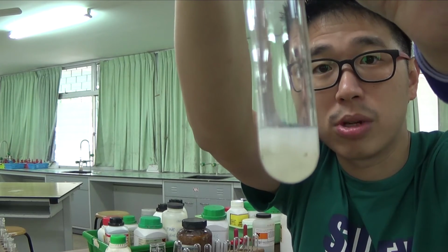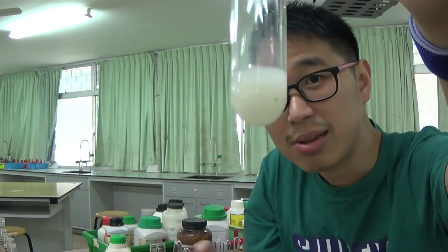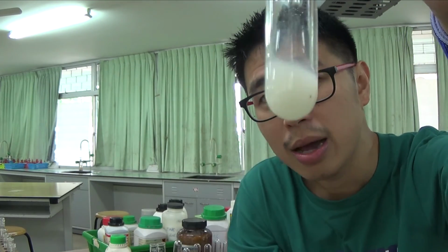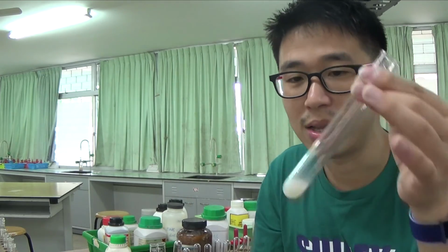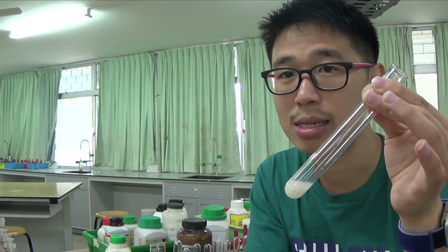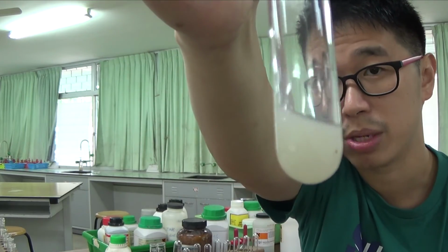You get a precipitate. You get a white precipitate. Sometimes the white color is not that clear, because remember you have the presence of a transition metal compound. Even though the transition metal compound does not react with barium nitrate, in the presence of other colors it can be difficult to see the color that you want to see, but this is very clearly a precipitate.